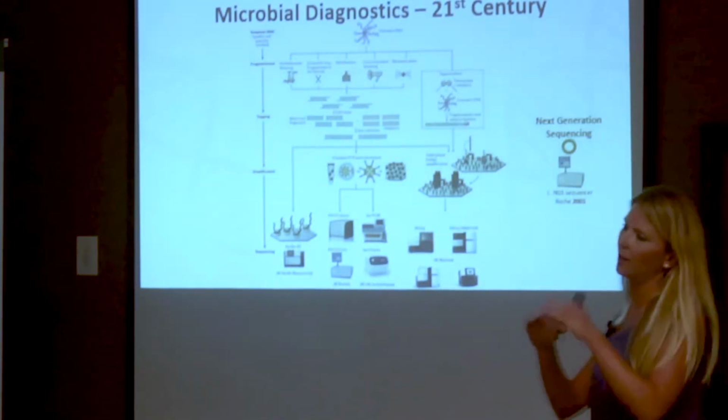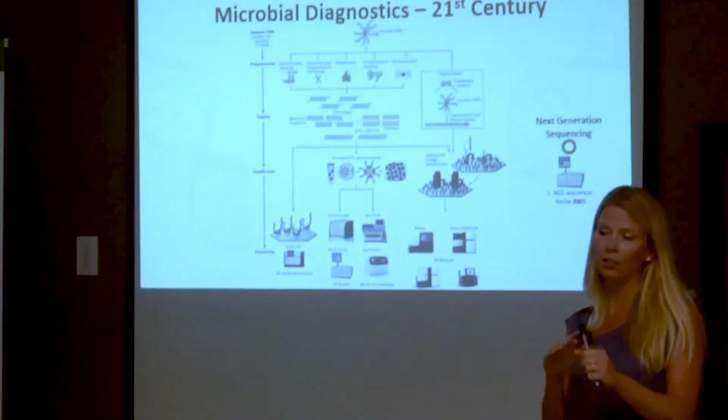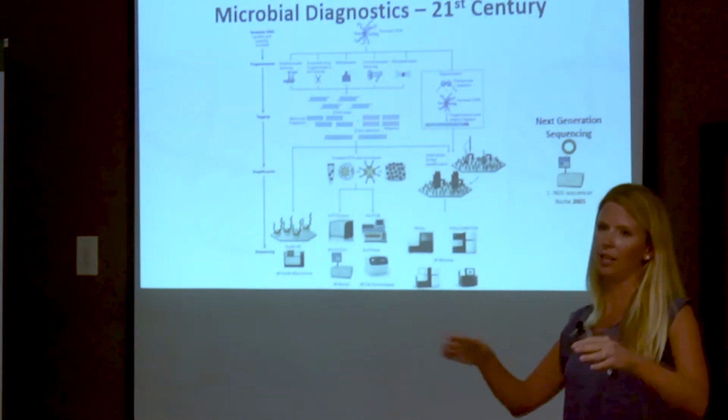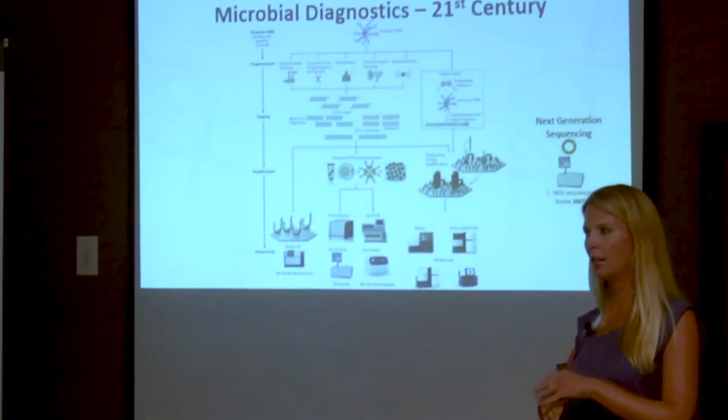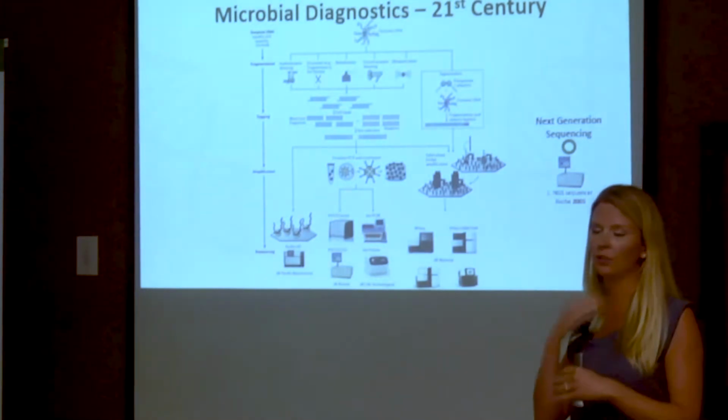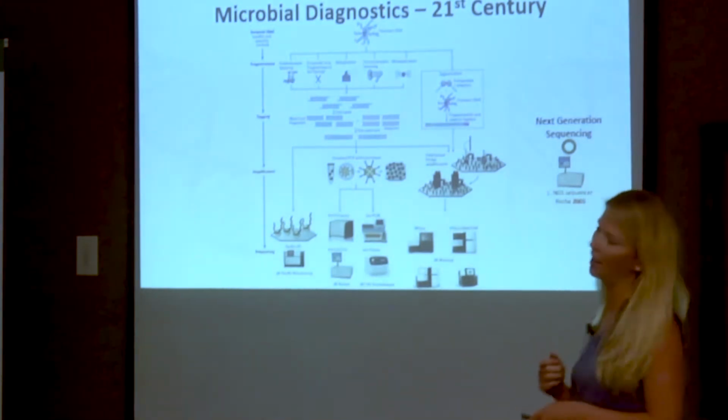And then you fragment the DNA into smaller pieces. You tag them, each piece, and then you massively amplify. You make multiple copies of them in a really large scale, and then you start sequencing everything in parallel. So it's really fast and very reliable.